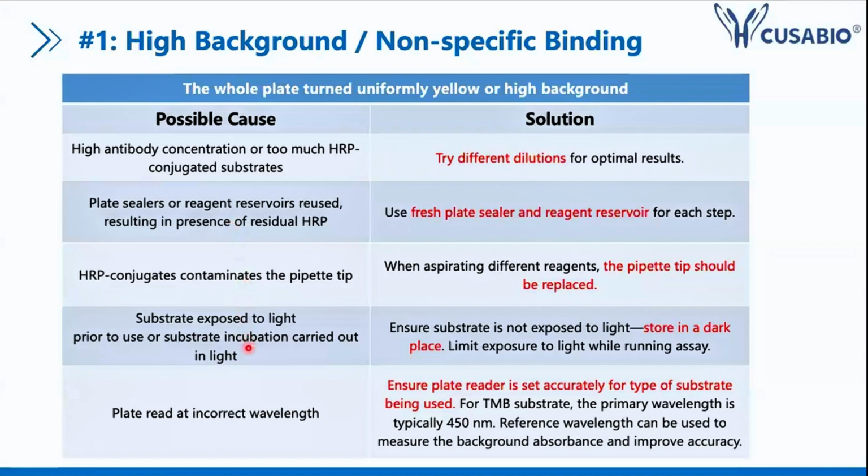Usually the substrate solution is clear or slightly blue. But if the color of your substrate solution has already turned blue, then my recommendation is to replace it or prepare a fresh substrate solution for your ELISA experiment.